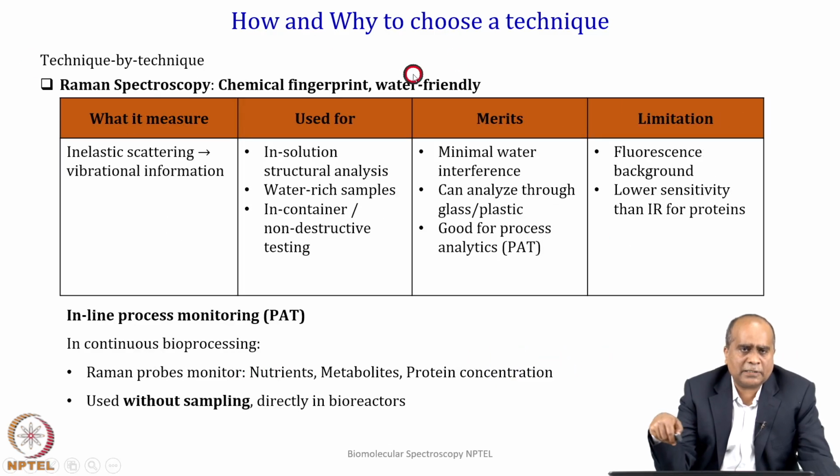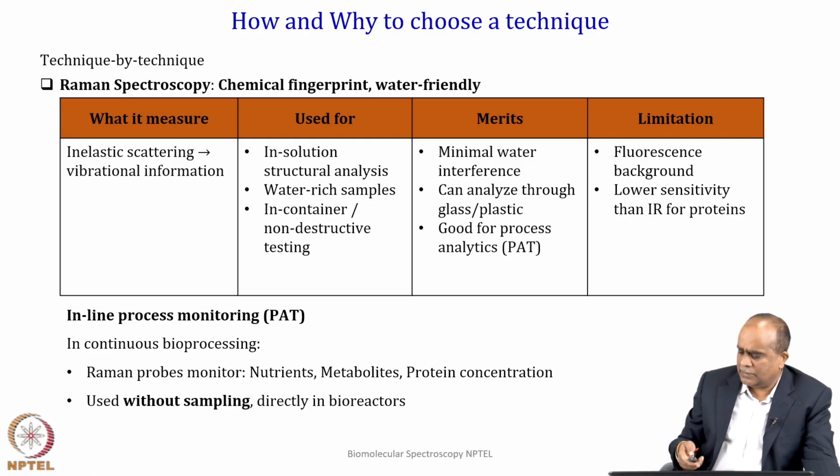Coming back to Raman spectroscopy, it is complementary to FTIR as we have seen. It gives you the chemical fingerprint, and it is water friendly. You do not need to worry about water absorbing, because it works on inelastic scattering vibrational information.